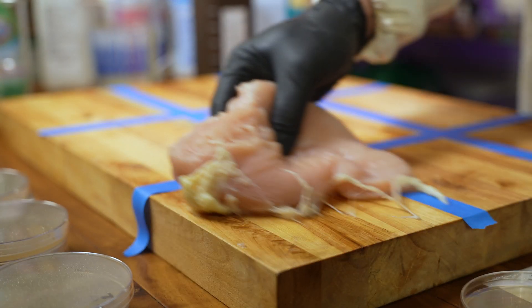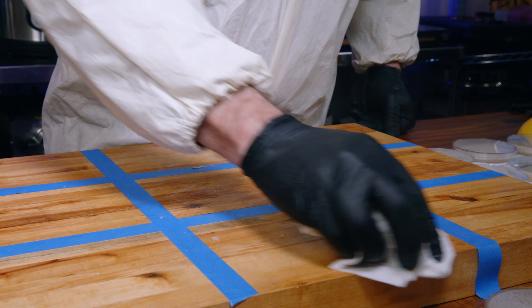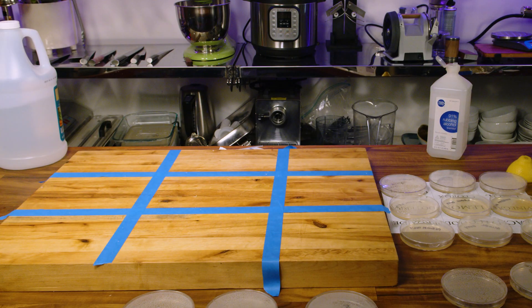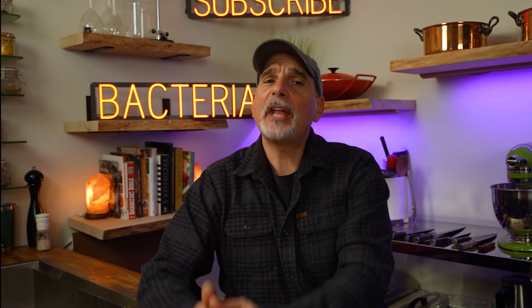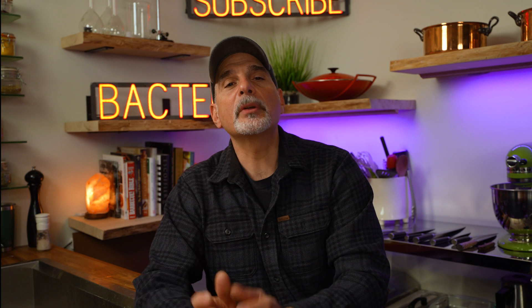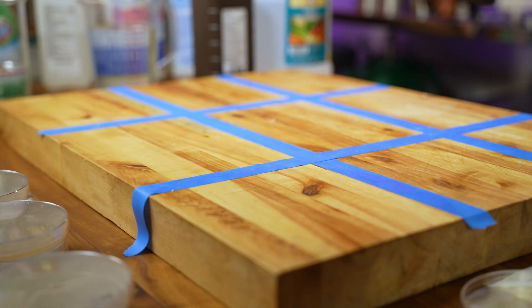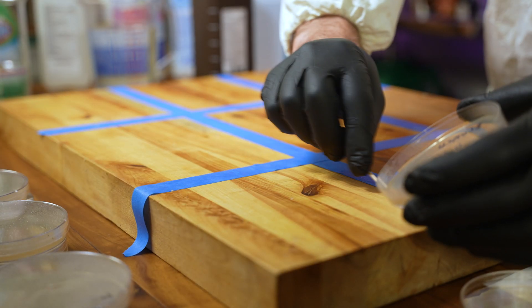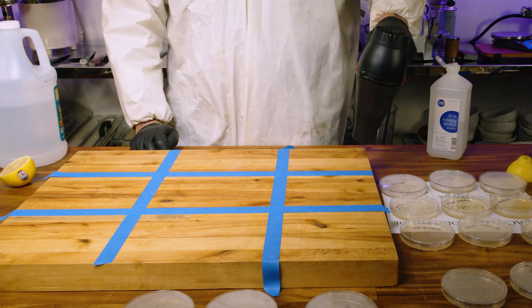I also want to see if these disinfectants work on their own without soap. So I'll recontaminate the cutting board with chicken, wipe off the excess with a paper towel, and apply the nine disinfectants without first washing the board with warm soapy water. Since national requirements mandate letting the surface dry when sanitizing with bleach or alcohol, I'm also curious to see what happens when we sample the alcohol and bleach sanitizers while they're still wet. After applying all disinfectants, I'm letting them dry.